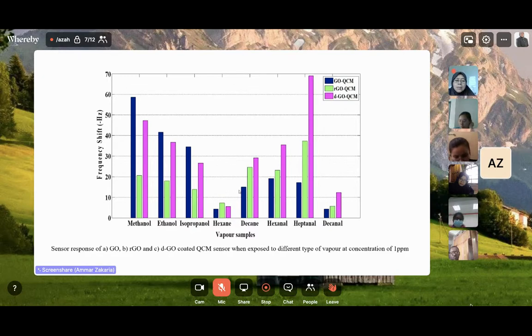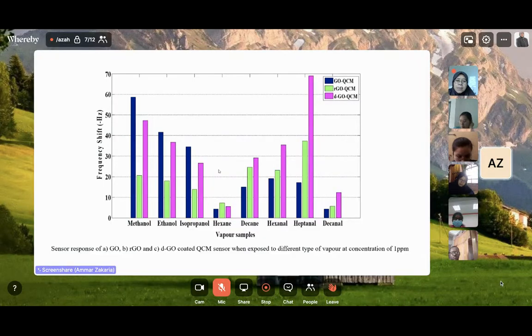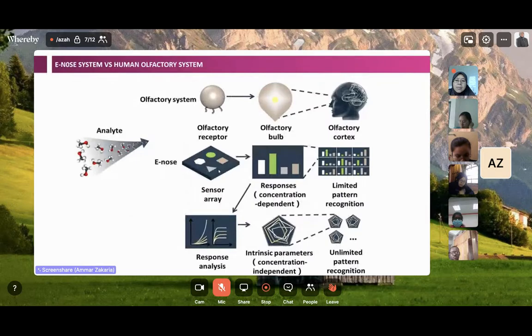when you have a large number of sensors, you will have another problem of how to capture the signal, right? Imagine you have 100,000 signals, then you will have a problem determining those cases, how to differentiate one from another, how to eliminate sensors that are not responsive, right? Those are the tricky parts that we will discuss now. Okay, right. So we covered this part.